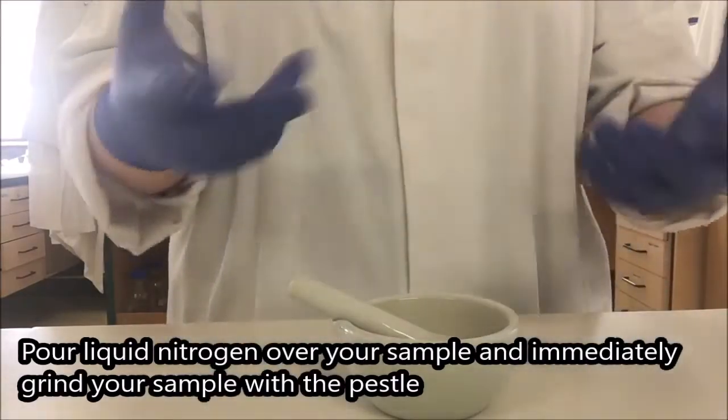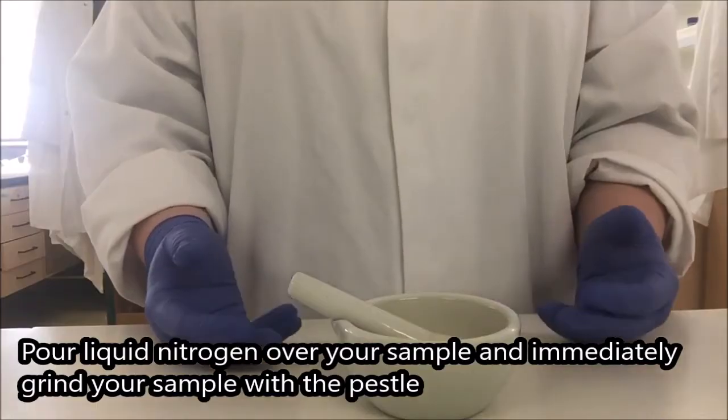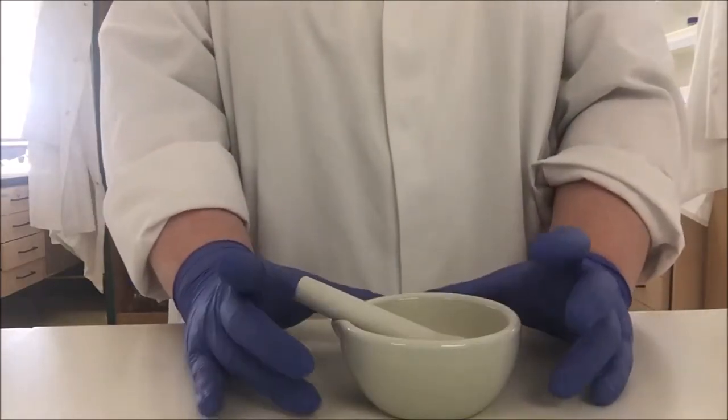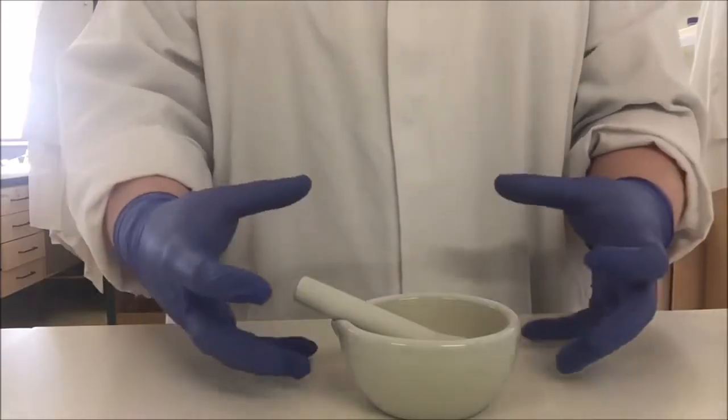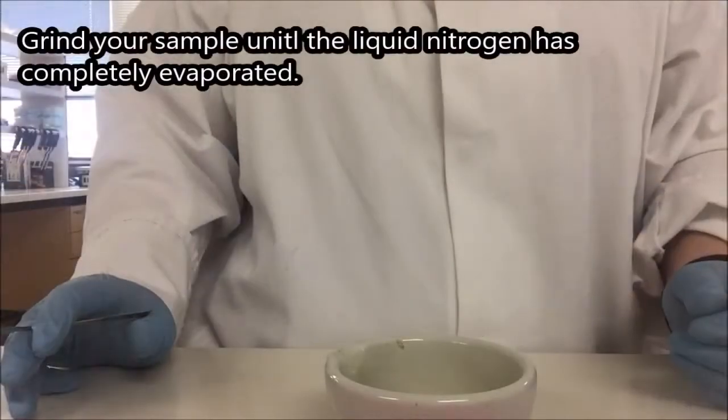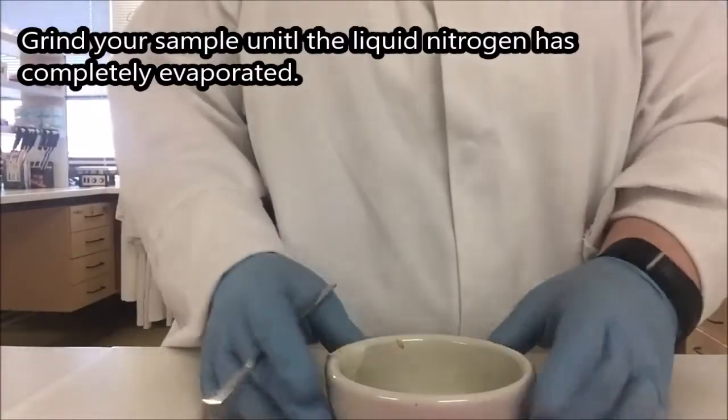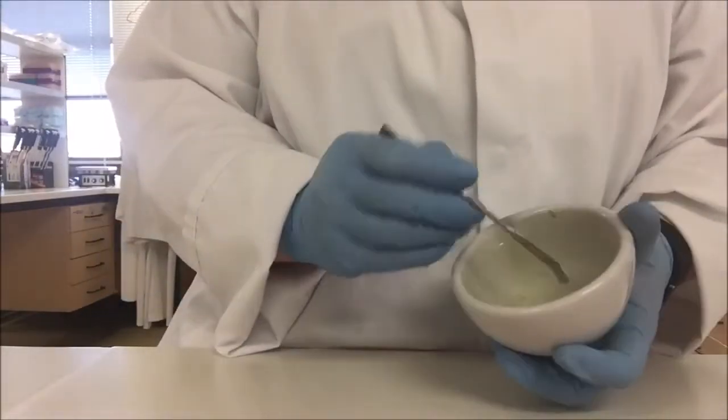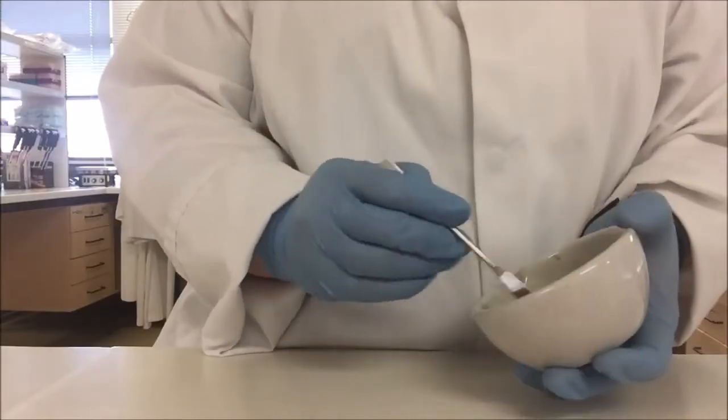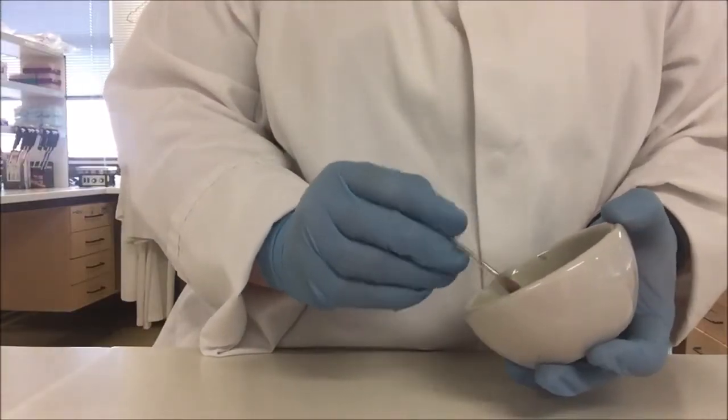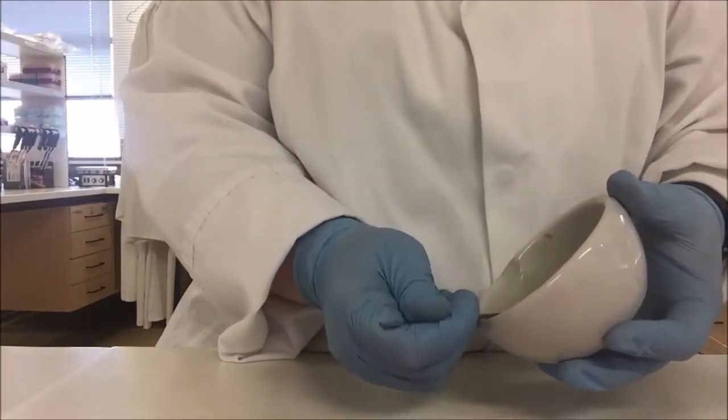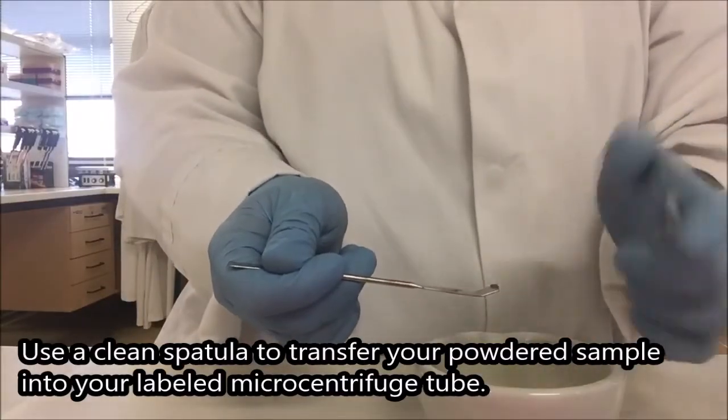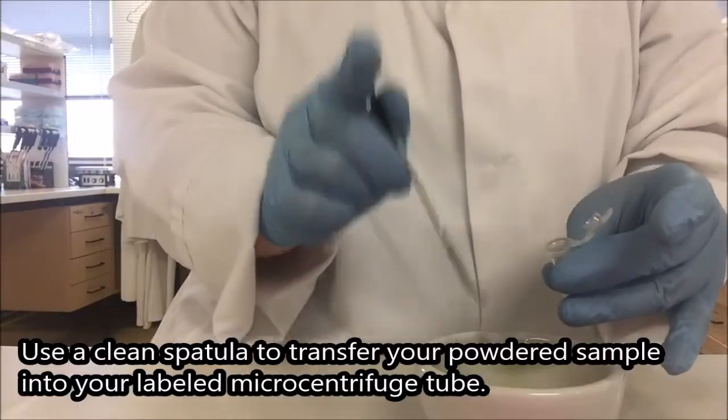When this happens, a white cloud of steam coming up from the liquid nitrogen which will make it hard to see. But what will be happening underneath that steam is that the liquid nitrogen will be boiling. Once you've done crushing your sample, you'll end up with a very fine powder and you're going to use a clean spatula to scrape everything down into one part of the bowl, scoop it up and into a labeled microcentrifuge tube that you have prepared in advance.